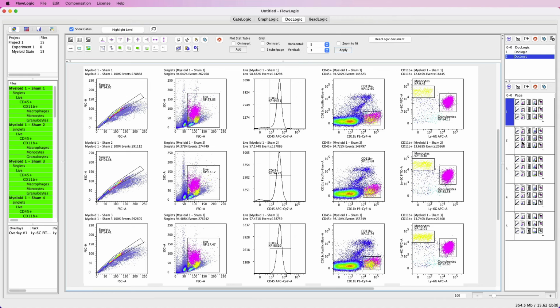One possible problem that can arise if you are making a grid with very large dimensions, for example, a 12 by 8 to mirror a 96 well plate layout, is that long titles, whether it be the plot title or the axis labels, will then suddenly run into the adjoining plots. To account for this, we can use a zoom to fit option. This means that the whole image, including the text, is shrunk as a single image.